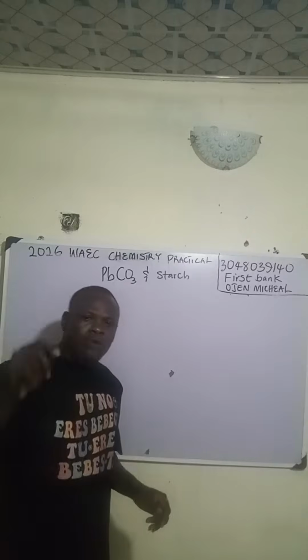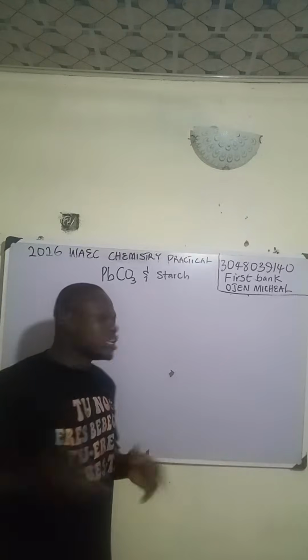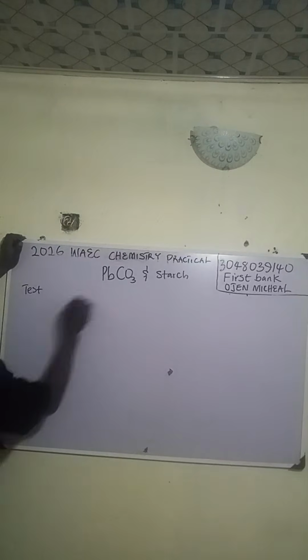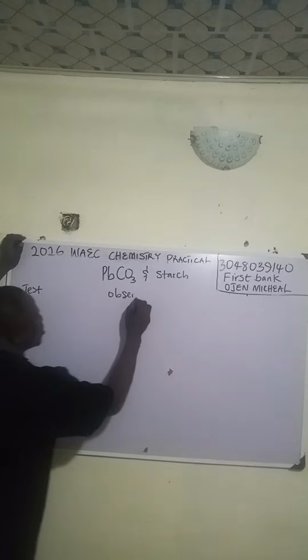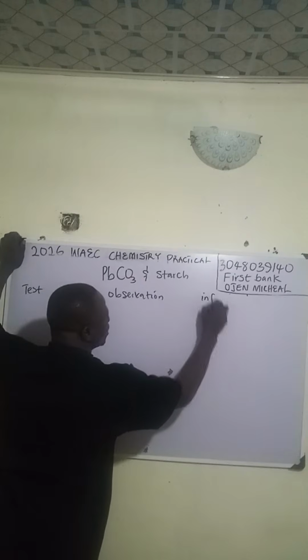Alright? Now, in your salt analysis, there is always a format in which you are going to report. What is the format? We have what we call the test. We have observation. And we have inference.